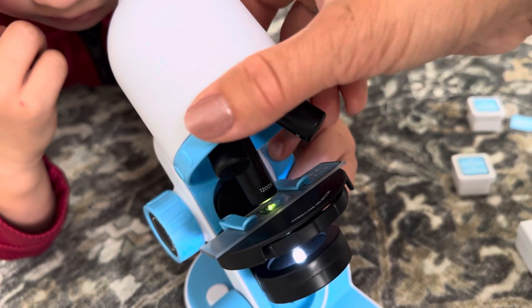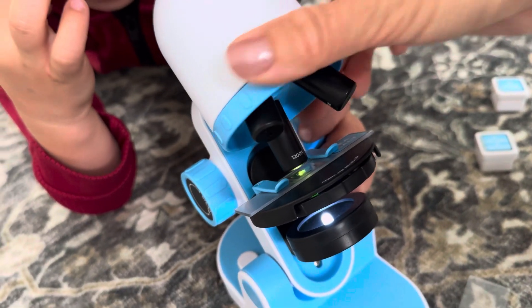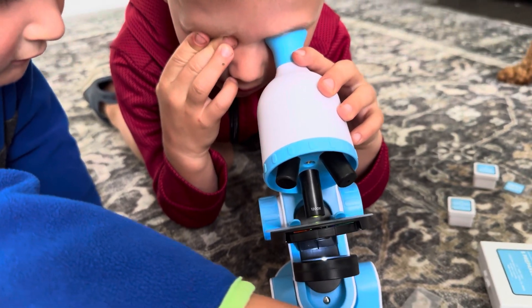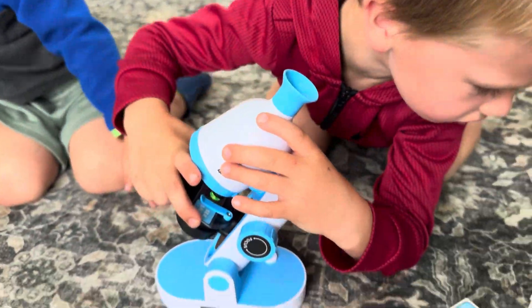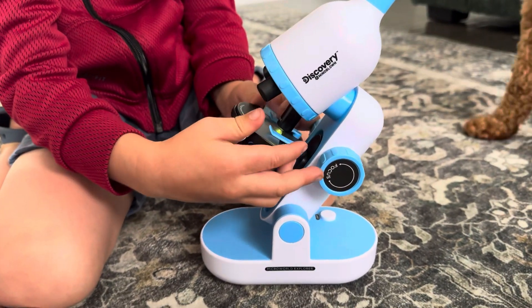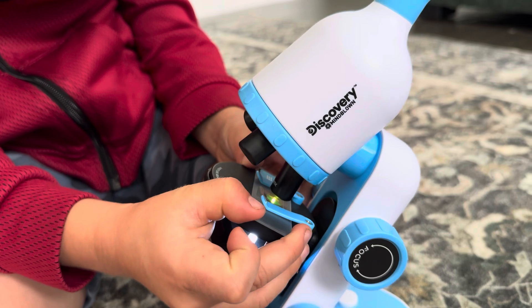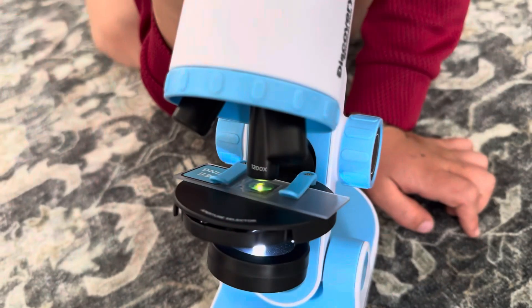Do you see anything? Isn't it cool, right? Let's try the bee wing.